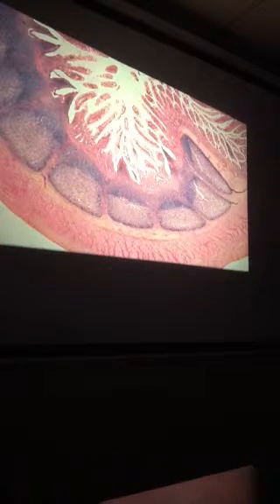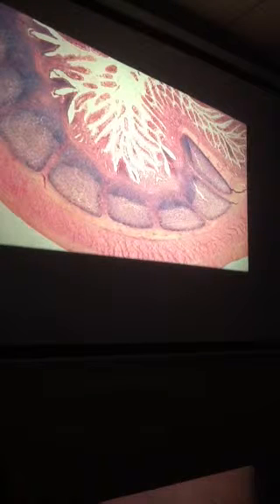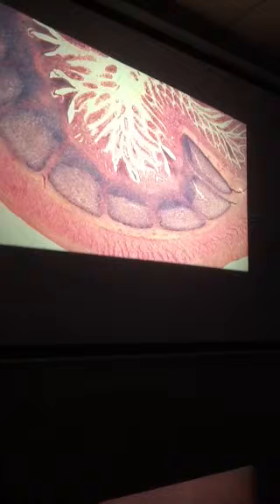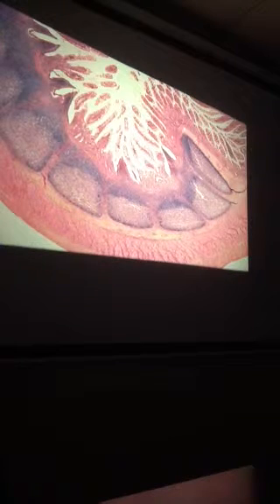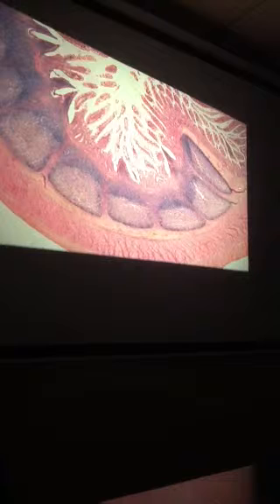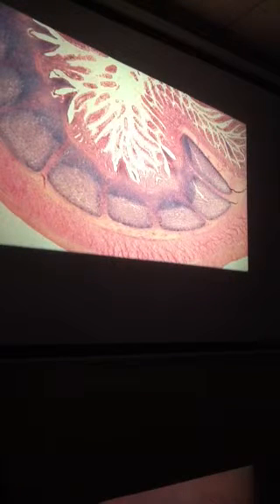So these are the villi, what's this? That entire structure. What are you gonna call this? Isn't that a hill? With the trees? So this is a plica, right?